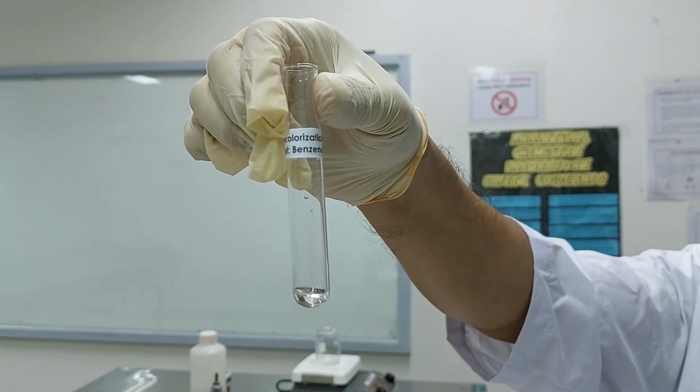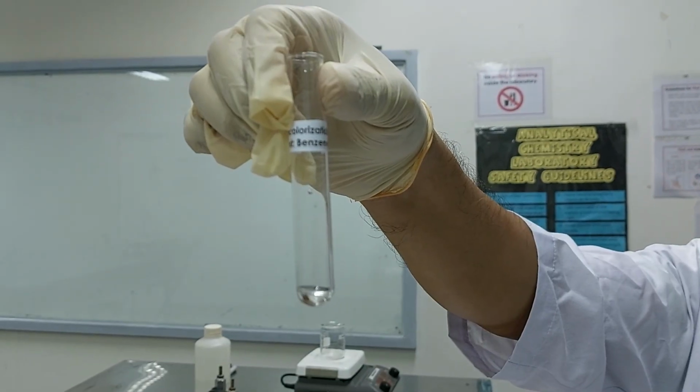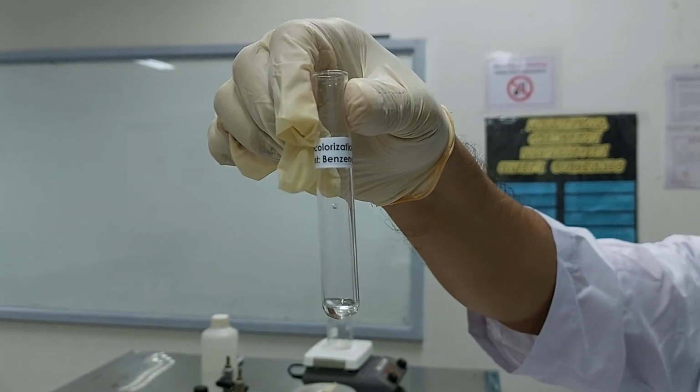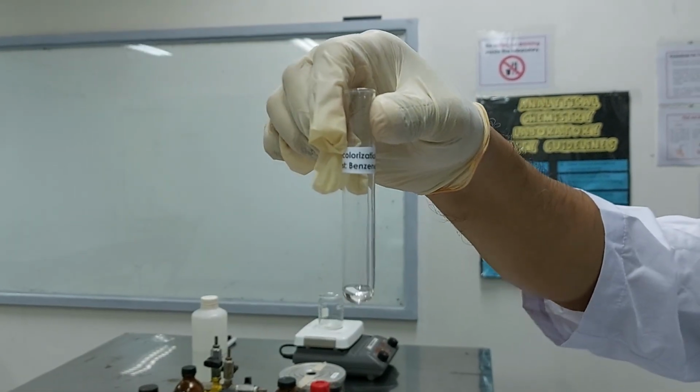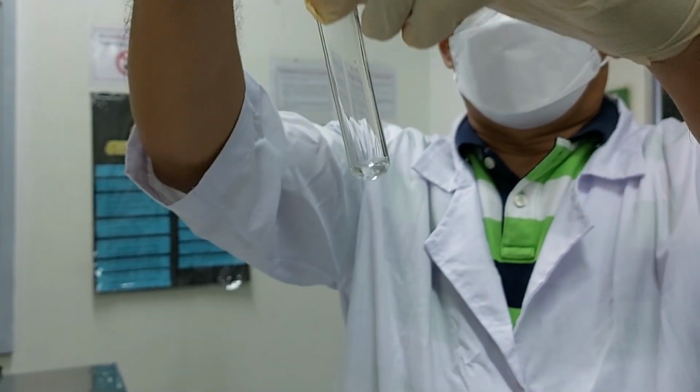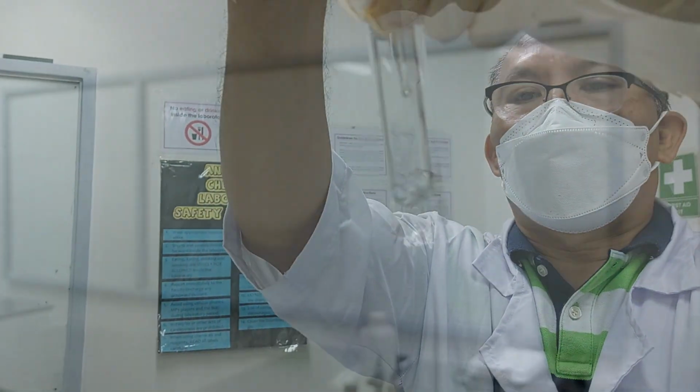We're just using a very small amount of benzene because our bromine is not very yellow, and we might not be able to see the difference. So let's see if the color will be the same.